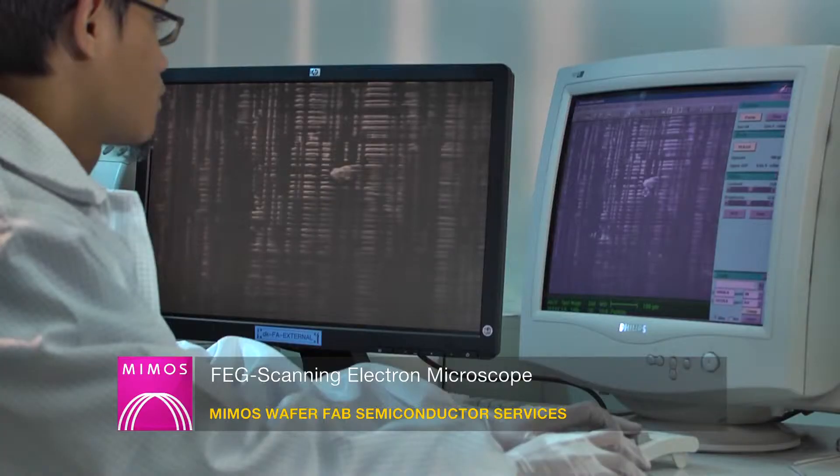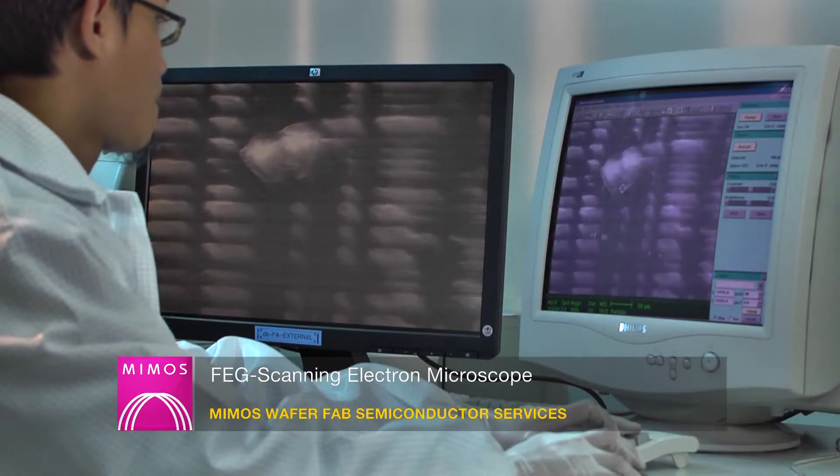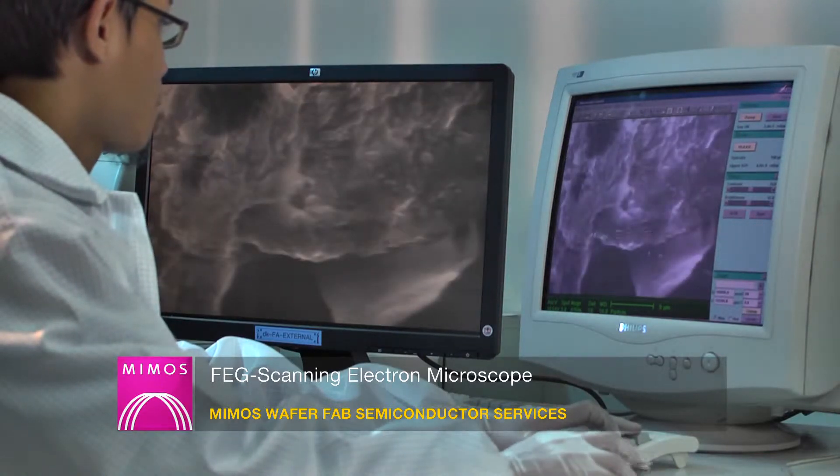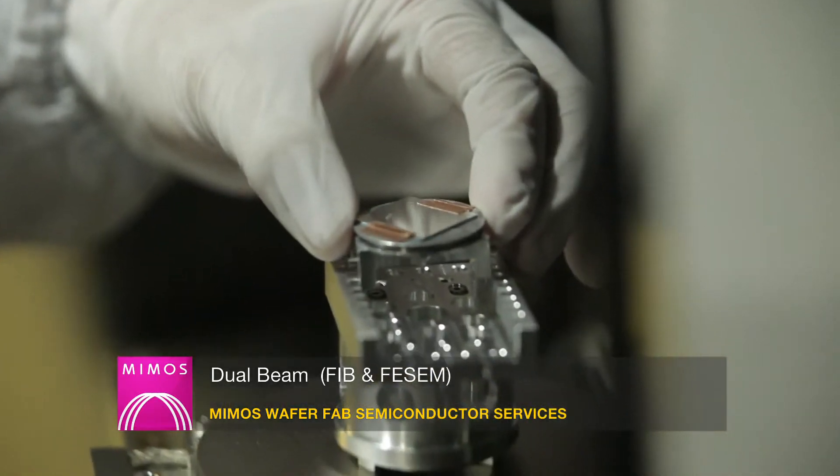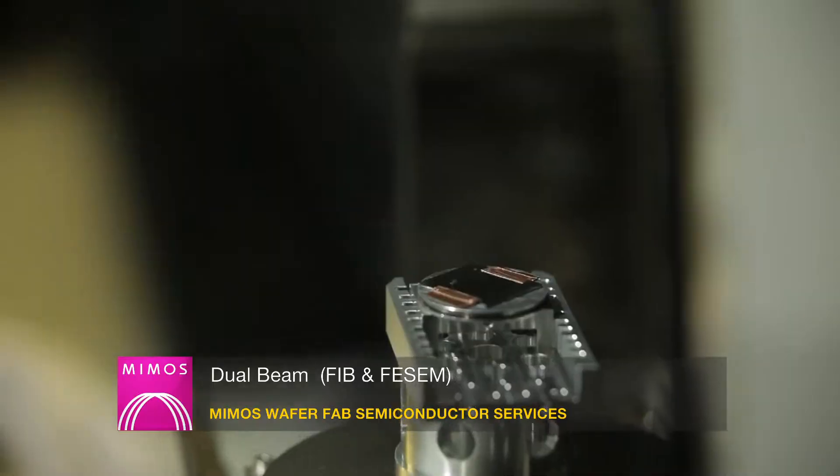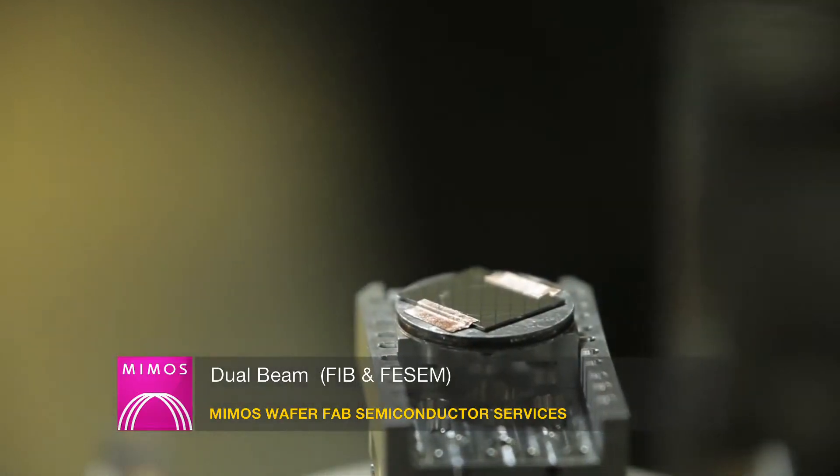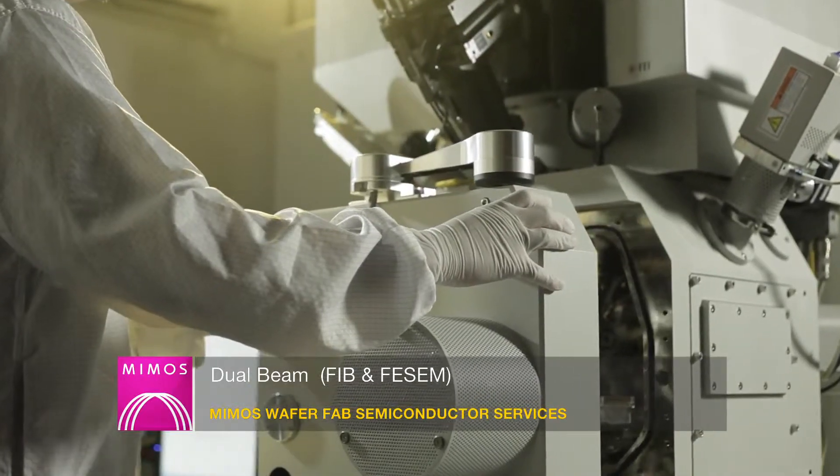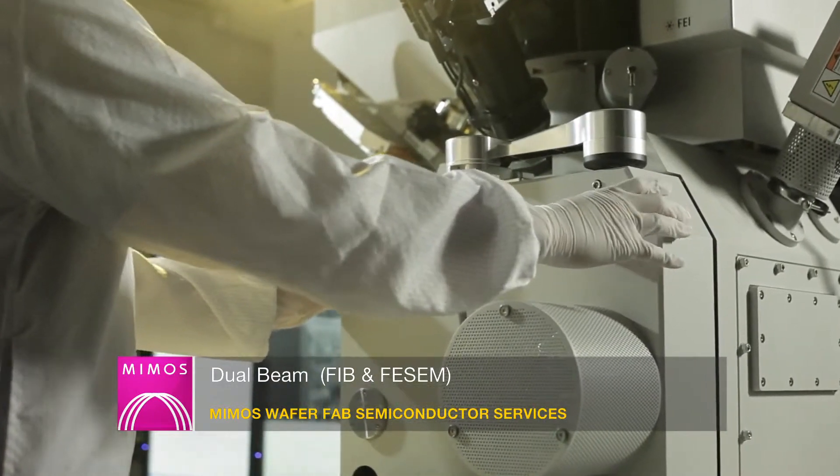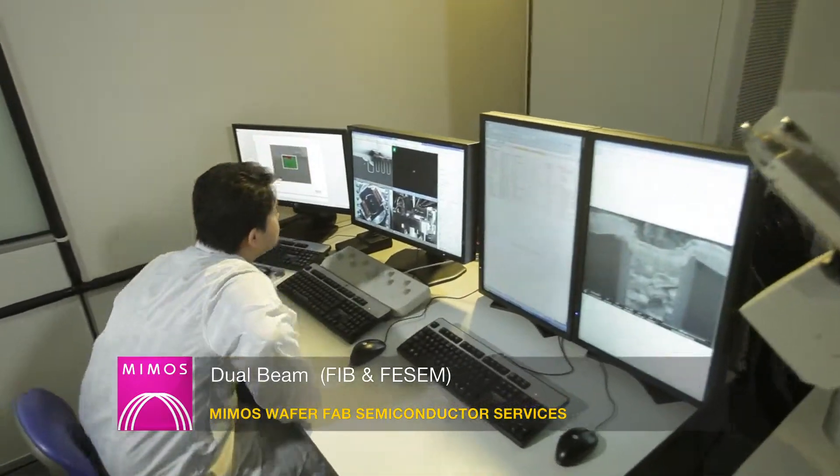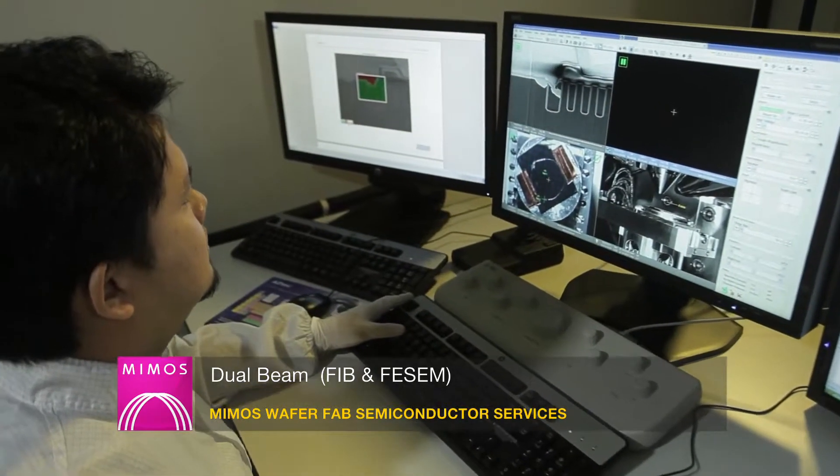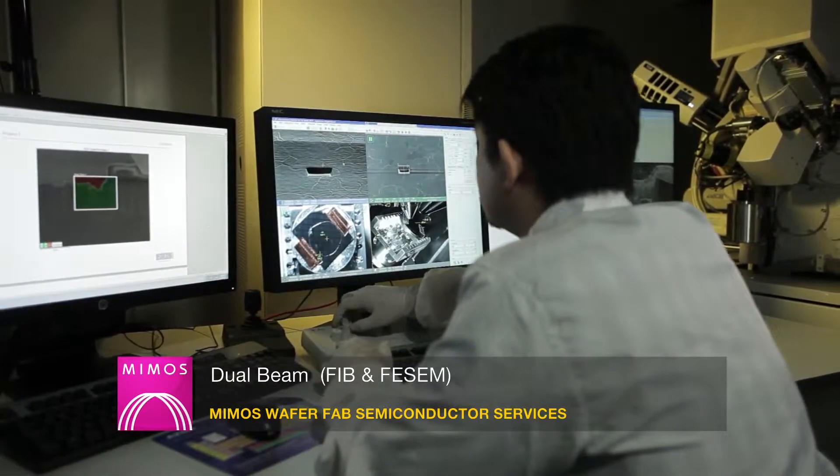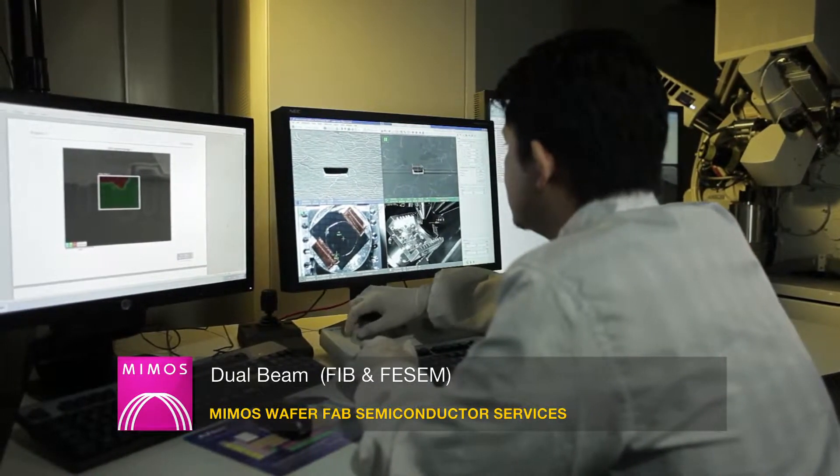FEG scanning electron microscope is an ultra-high resolution inspection system. It is able to reveal topography and morphology of the samples at very high magnifications. The dual beam incorporates both a focused ion beam FIB and a scanning electron microscope SEM in a single system. The system has the ability to perform precision micro cross-sections of the IC features and deposition of conductor and insulator within nanometer tolerances. Its application will cover open probe holes, rewire circuits, device isolation and generate high resolution images using FIBSEM.